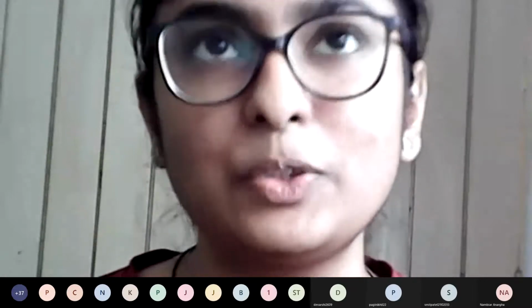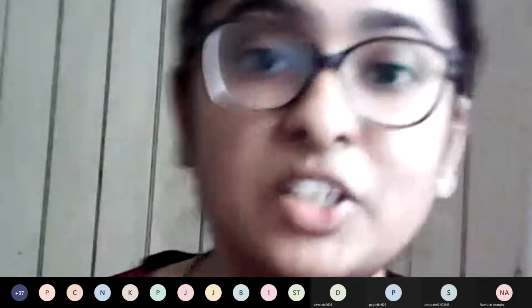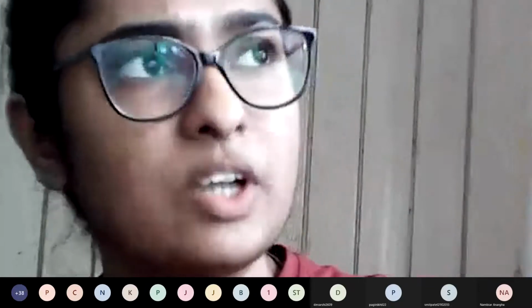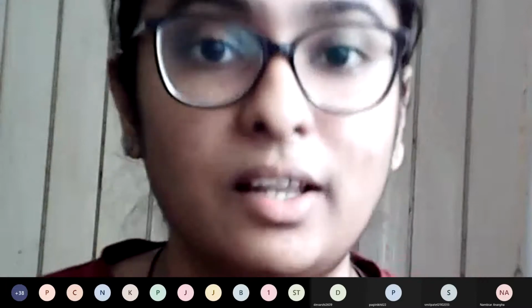You won't be able to say if it is orange or if it is yellow, and somewhere even you will find red shades also. This actually happens with students, and they come to us and bring the flask. मैम येलो आया, मैम ऑरेंज आया, मैम रेड दिख रहा है. अब आपने परफॉर्म किया है, आपको पता है आपने क्या क्या डाला.